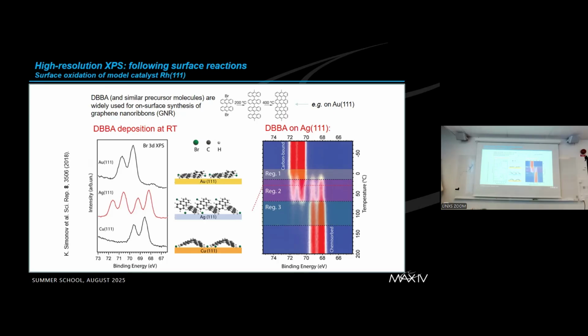Anyway, just for fun, at the other synchrotron we had a big magnet, like 10 Tesla, next to us when we measured the emissions. When it switched polarity, we also saw it shift the spectrum, but it was like 5 meters away. So still definitely not the best. More questions?